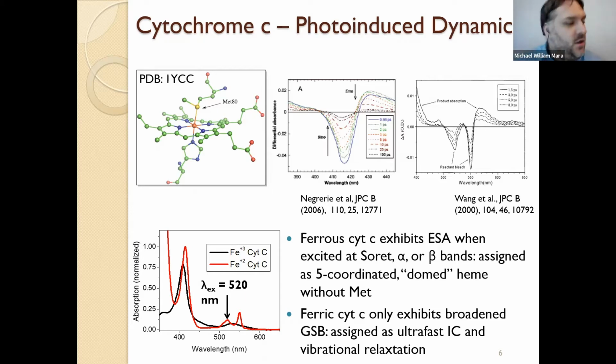So one thing that we want to avoid is multiphoton absorption of the optical beam, right? So you can increase the power indefinitely. However, at some point you're going to lose. It's a basic Beer's law argument, right? At some point you lose linearity of the absorption of your photons versus the excited state fraction that you generate. At that point, you have multiphoton absorption, which could have strange effects on the sample as well as the bulk solvent potentially. So what you do is you do what we call a power titration.